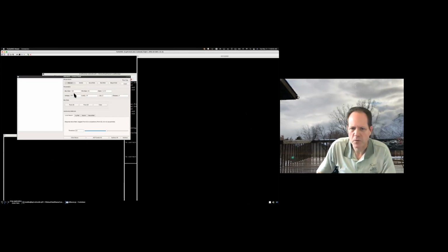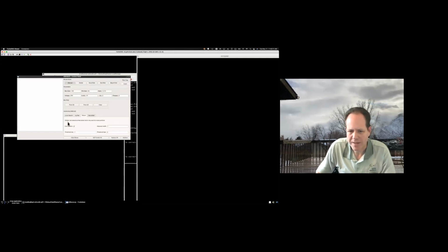Present in the project. I just want to show you that we've got the various tabs here for automatic particle picking. Now when you pick each of these tabs, it will tell you what you have to do to use each tab. And there's a little bit more documentation in the individual fields. And I think we actually added one more to this as well. So this will tell you basically a little bit about what you have to do.